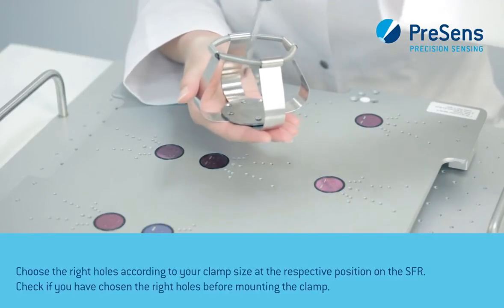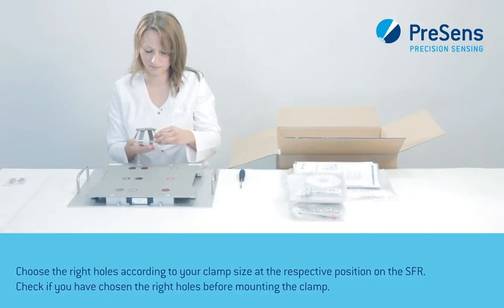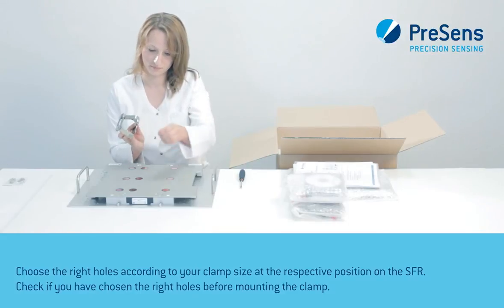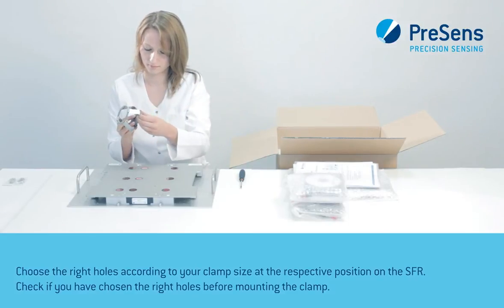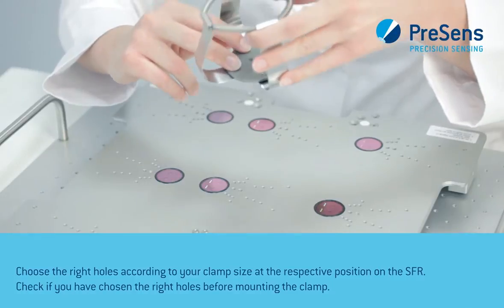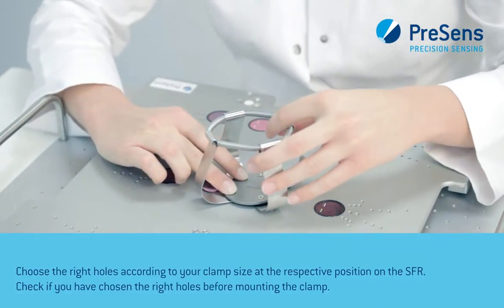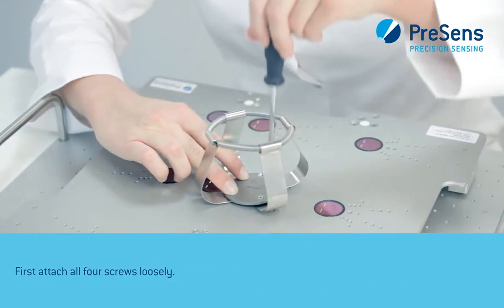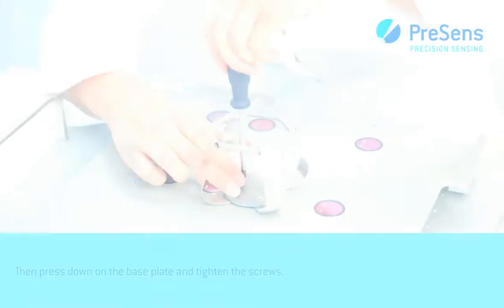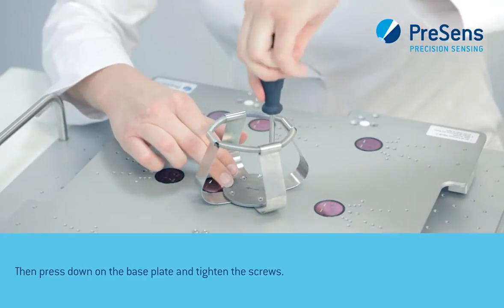Choose the right holes according to your clamp size at the respective position of the SFR. Check if you have chosen the right holes before mounting the clamp. First attach all four screws loosely, then press down the base plate and tighten the screws to avoid detachment of the clamp.